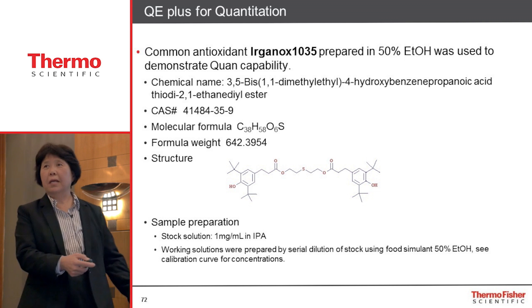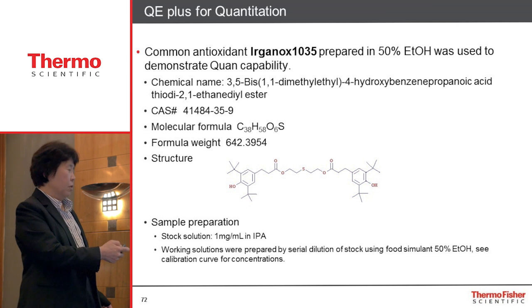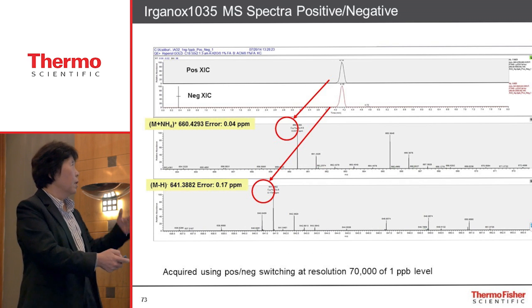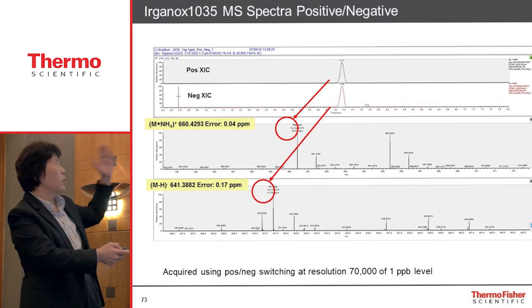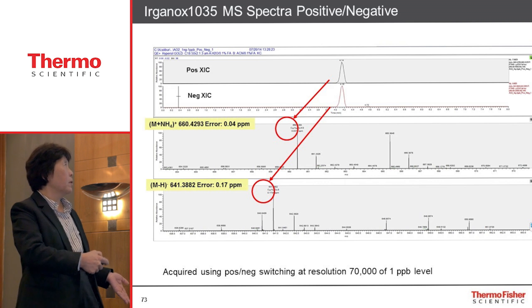I have to mention this quantitation capability of the Q Exactive, right? We know this is one of the antioxidants, right? Simply, we just made the solution and ran full scan, making sure the mass is right, and sure enough, right? We got a very good mass accuracy.